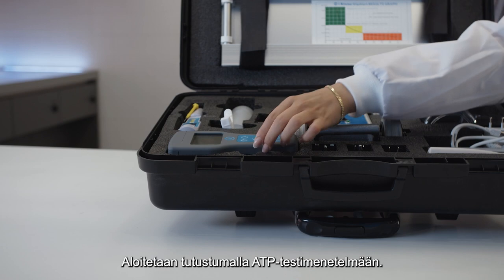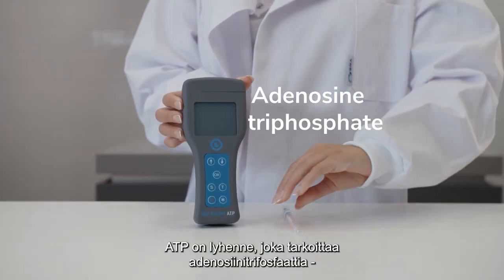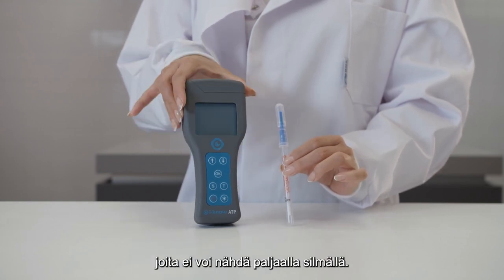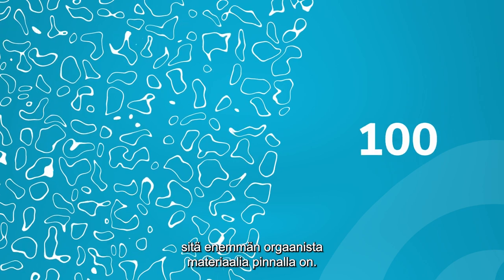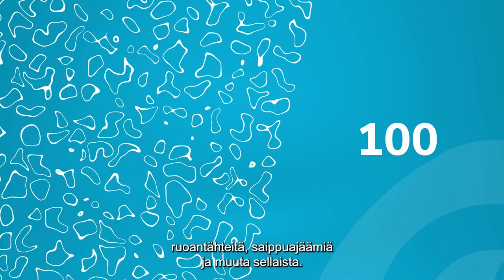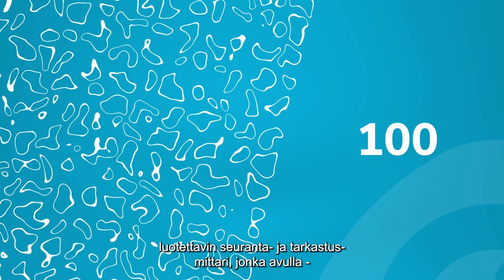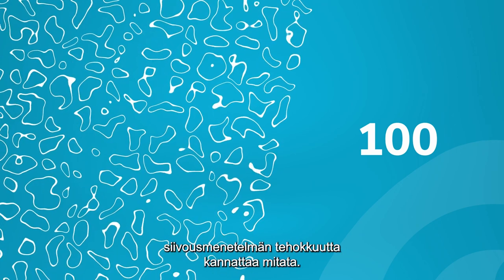Let's start with the ATP testing kit. ATP stands for adenosine triphosphate, an energy molecule that is an indicator of biological contamination invisible to the naked eye. It is found on all organic materials. The higher the number, the more organic material is on the surface — this gives bacteria a place to grow. Organic material can be bacteria, food leftovers, soap residue, and more. Detection of ATP is recognized as the most reliable quantitative monitoring and inspection method to measure the effectiveness of cleaning procedures.